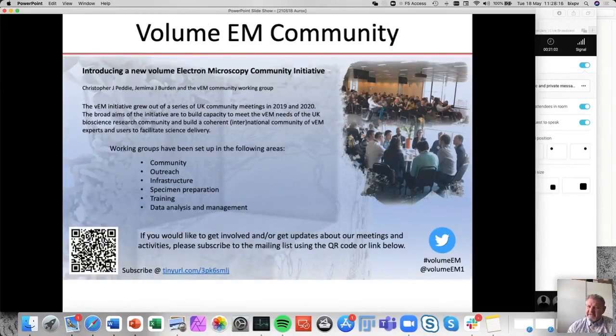And this whole volume imaging is really taking off. So we had the revolution of cryo-electron microscopy. I'm sure most of you have heard about that. There's now a whole movement which looks at molecular detail. But there's this whole other movement that looks at connections, larger volumes, and this vEM community, we've really set up a whole community discussing how we should approach that.